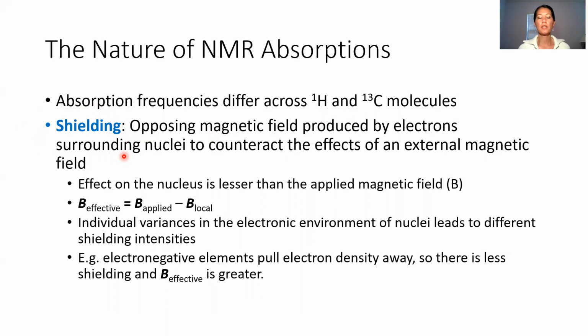Depending on what kind of nuclei they are or are attached to, that will actually counteract the effect of this applied magnetic field. So the effect of that is you get this kind of effective magnetic field, where it's the applied minus that local one.